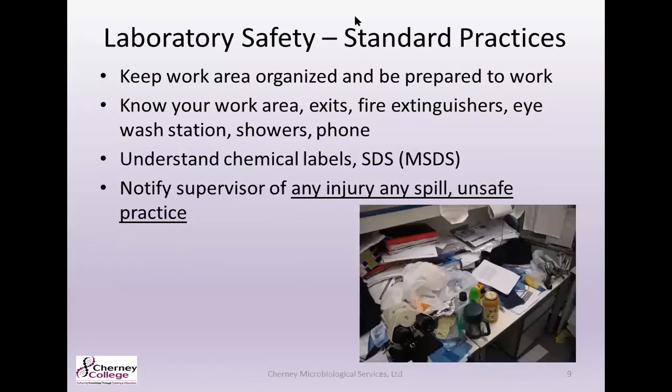So standard practices for laboratory safety, you're going to want to make sure that your area is neat and organized. I don't know about anybody else, but that picture below gives me a little bit of anxiety. You've got no clean space to work. There's a banana for somebody's lunch, an open mouthwash, what looks like a used glove, and a PCR plate. It's just kind of a mess.